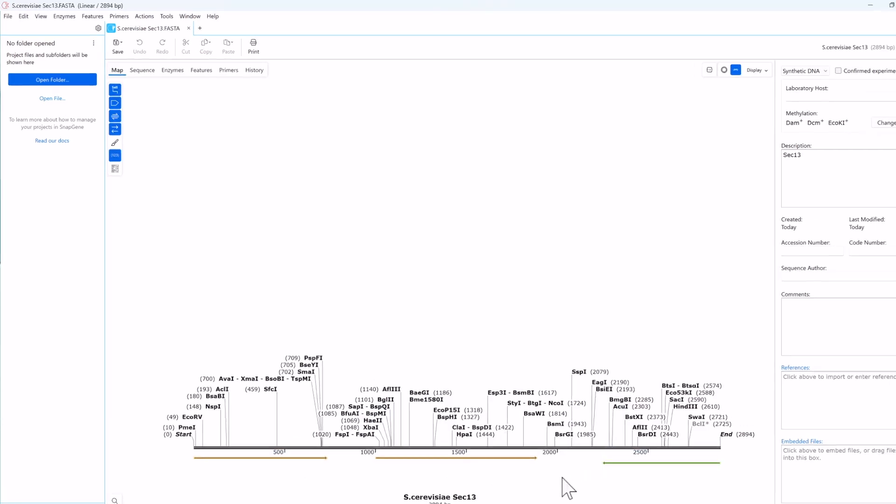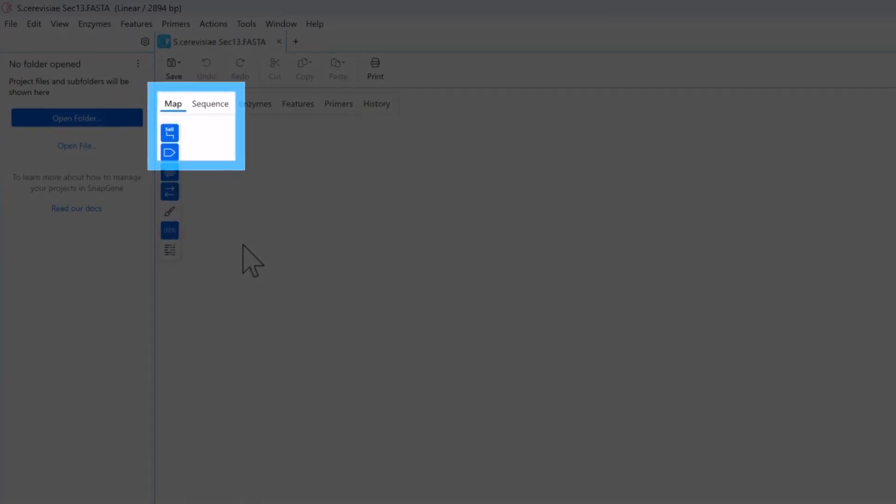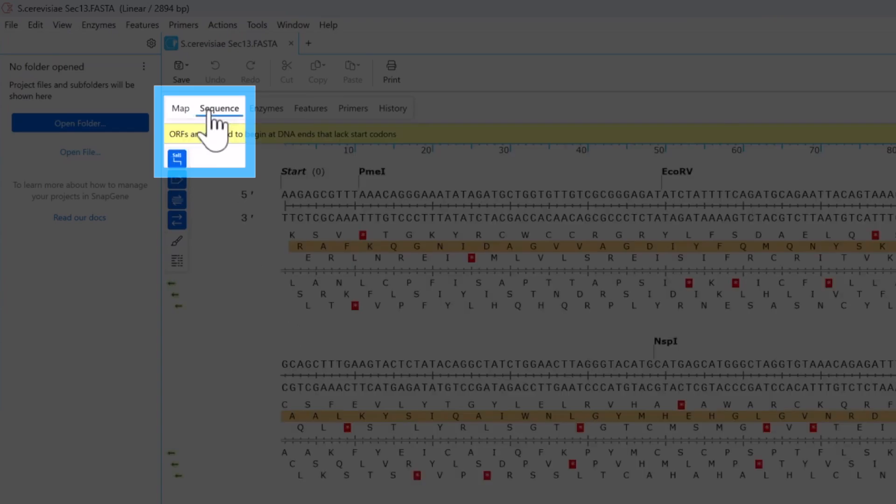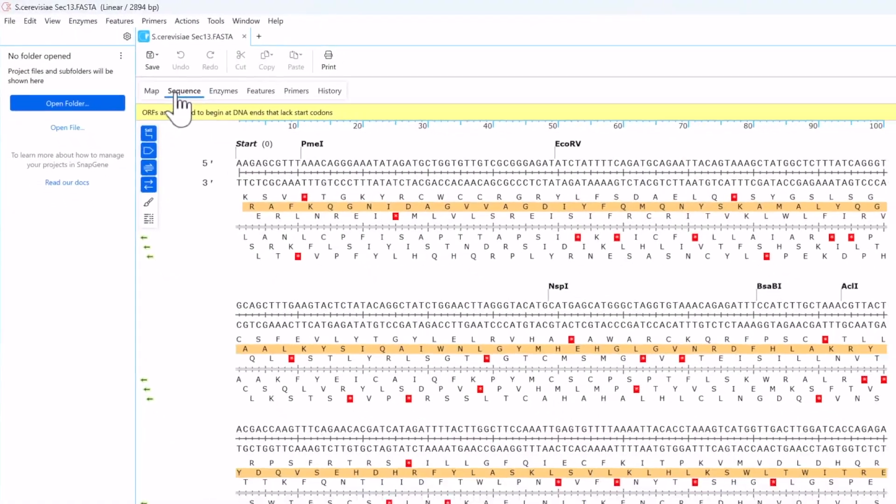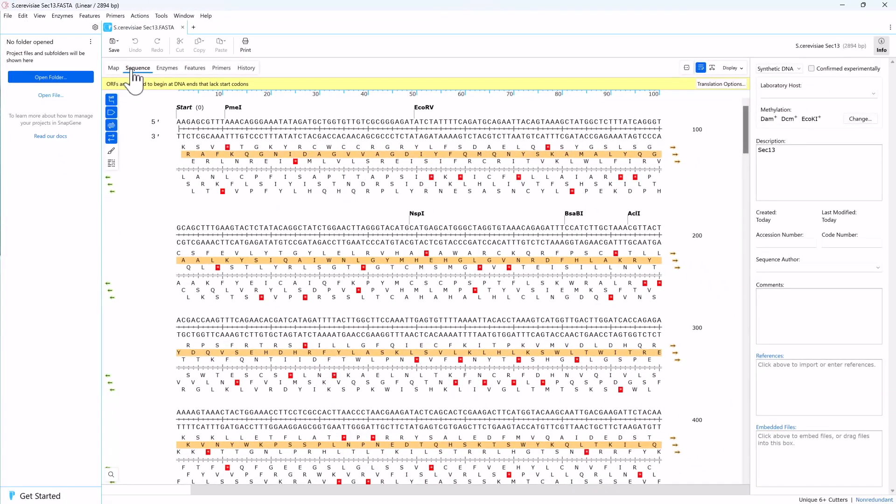For a better look at the sec13 sequence, switch to the sequence view. The amino acid sequence of the predicted open reading frame is shown below the sequence and highlighted in orange or green depending on the orientation.